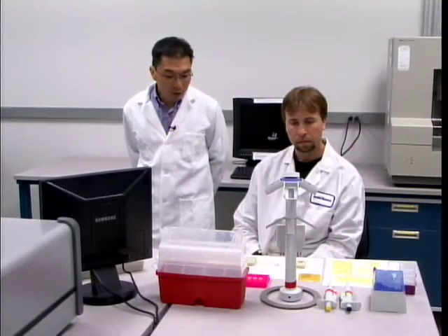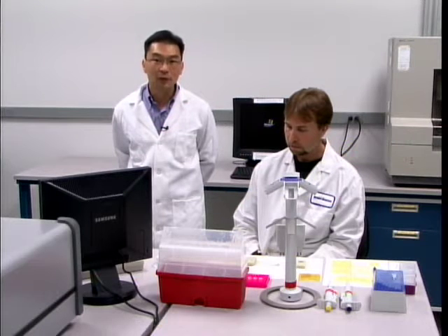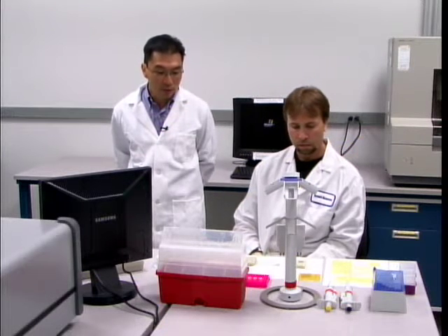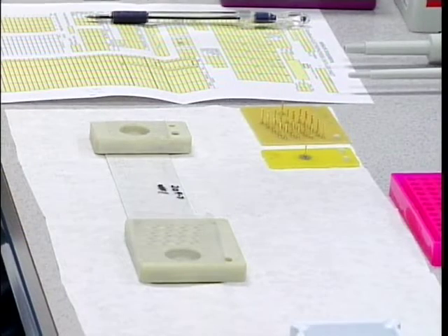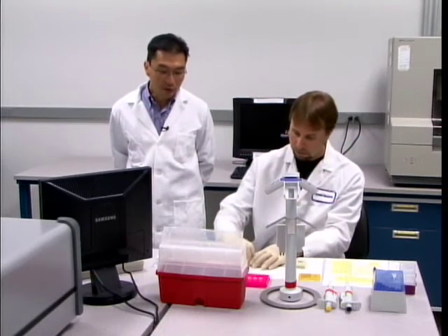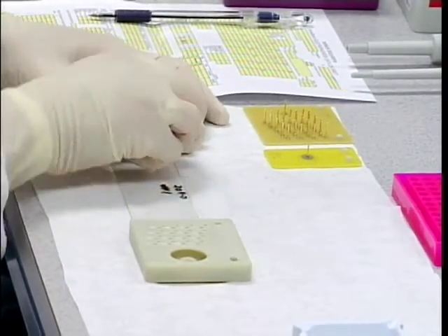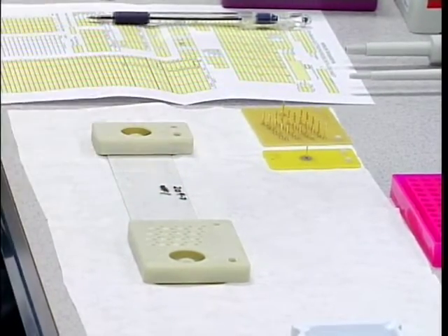We're now preparing the chip for running. What you have here is a microfluidic chip. It has 16-sample analysis capability and has been pre-filled with sieving matrix. Mark is going to start by removing the covers on the chip so that he can insert buffer and sample into the appropriate reservoirs.